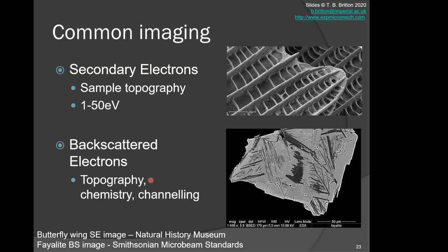If you have an inclined surface, then the billiard will be reflected off at a different angle. So if you set up your detectors well, you can get something called the topo image by looking at the different trajectories of the backscatter signals. Similarly, the backscatter coefficient of your system can give you access to chemistry.